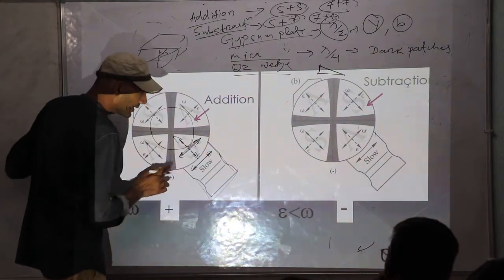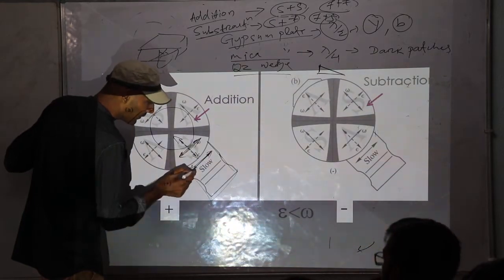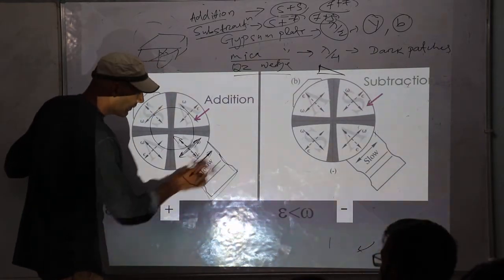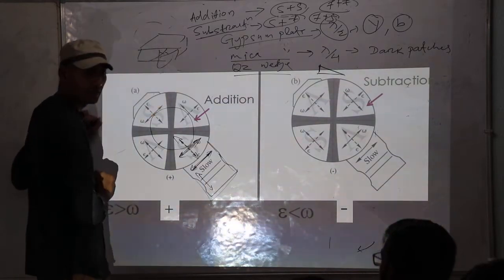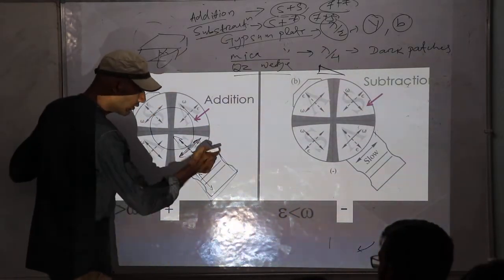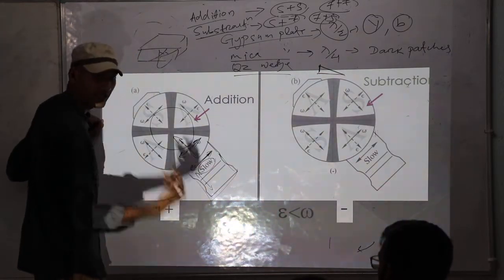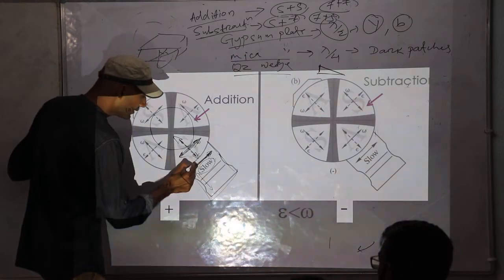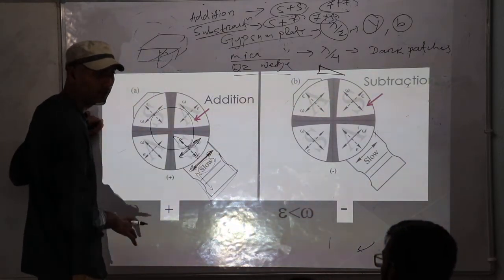Okay. Let's consider only O ray. So I am taking this vibration. This accessory plate has this vibration direction and this vibration direction. If this is slow, this will be fast. It is mentioned in the accessory plate itself that it is slow. That can be anything, but that is mentioned in the accessory plate, right?